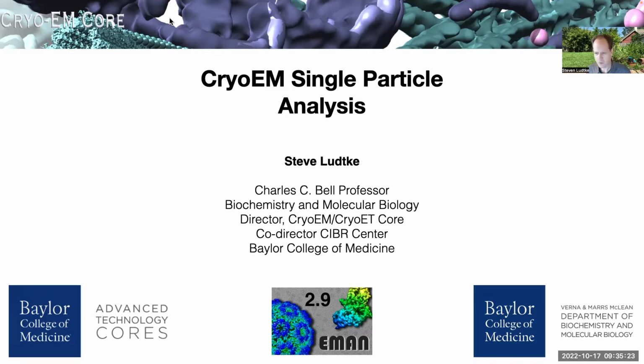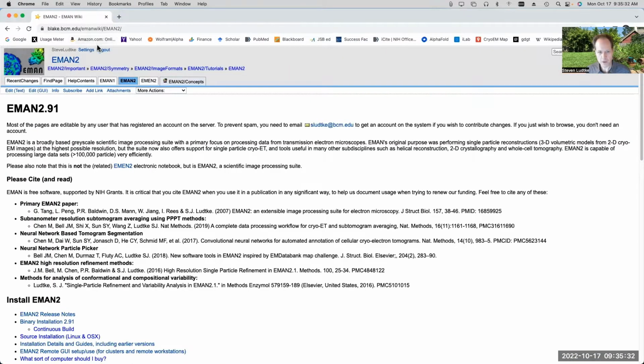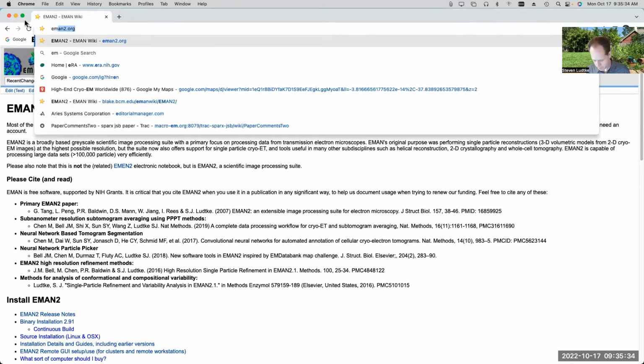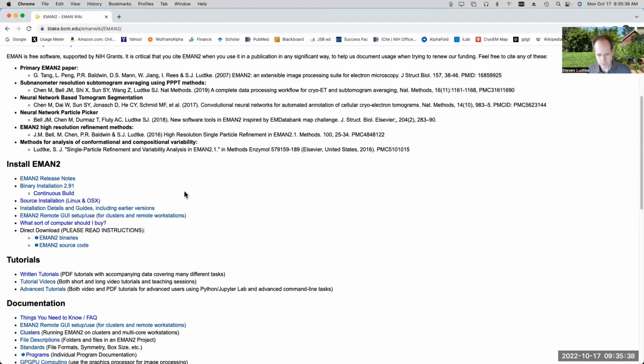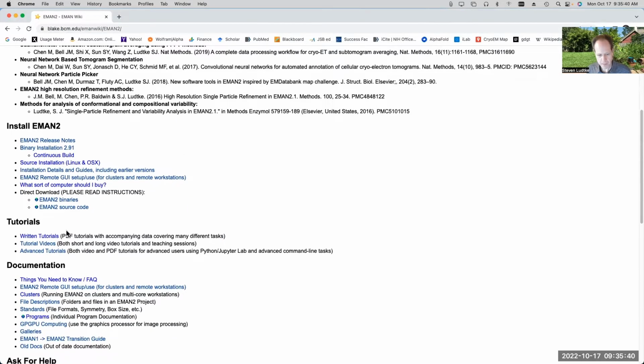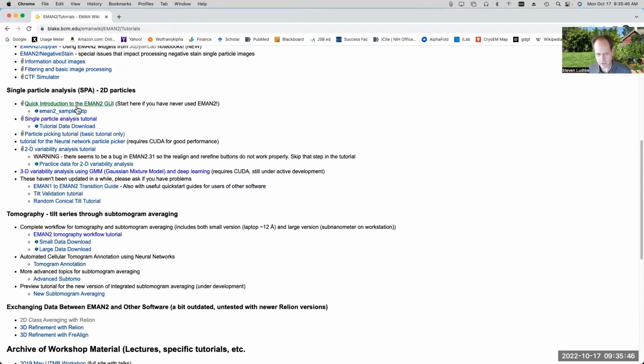Before I start with that, let me go to the EMAN2 webpage. If you go to eman2.org, you'll get this nice web page, and under written tutorials, you will find the single particle analysis tutorial. This single particle analysis tutorial right here is what I'm hoping that everyone will go through before next week.